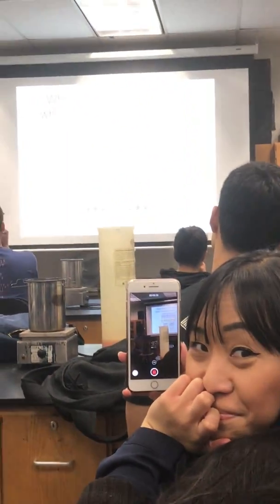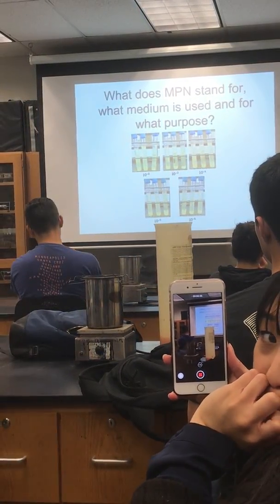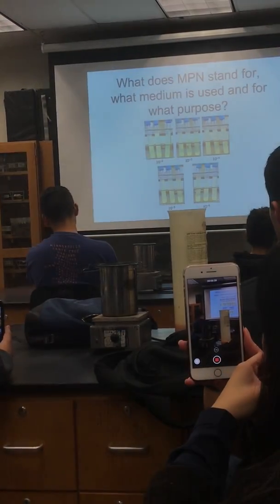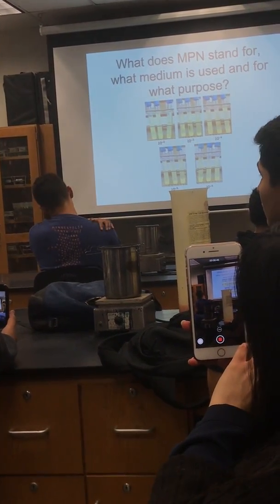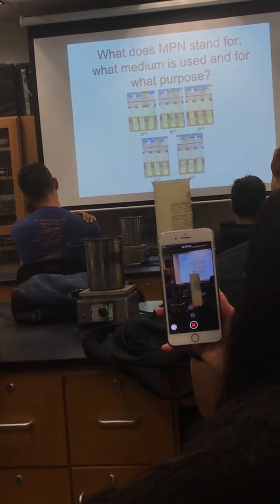How do we presume that we've seen lactose fermentation? Gas in a Durham. Gas in the Durham vial. And what gas is that? What gas from fermentation? Carbon dioxide, CO2. That's part of fermentation, okay?